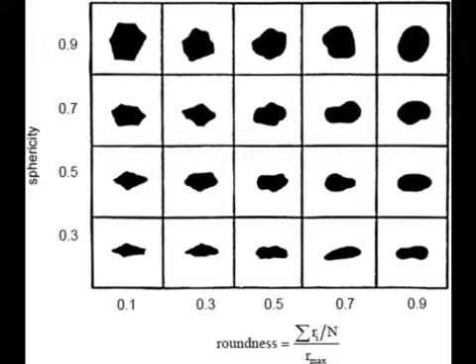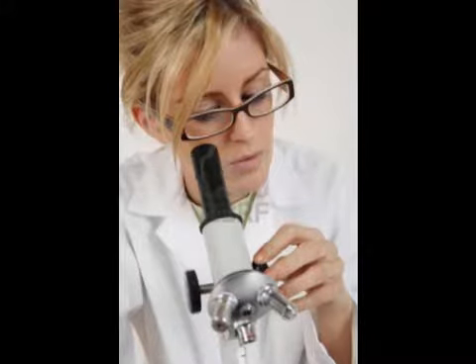We randomly select 20 or more grains, view them through our microscope. Here's someone looking through a microscope. And what you do is you compare the sand particles in the field of view to that Krumbein and Sloss chart, and you keep doing that for all the grains, doing it very meticulously and carefully to make sure that you don't get off onto another grain, that you're capturing the quality of each grain.